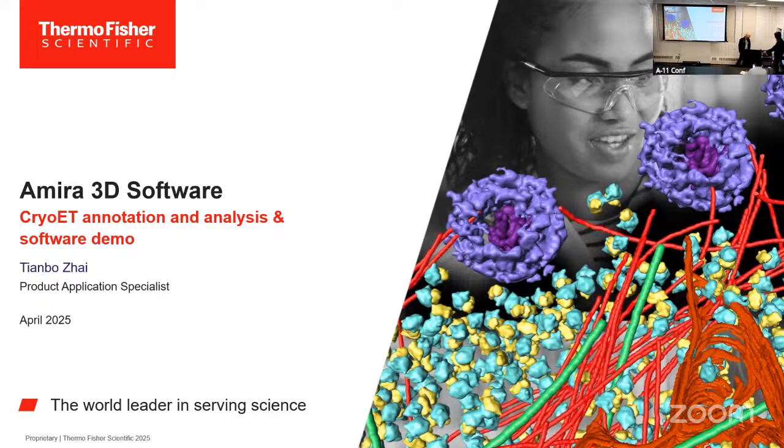What is your favorite part of the CryoET workflow? Tianbo, you go first. For me, that probably will be the annotation part of it, because nowadays there are an array of different tools available for me to do a pretty accurate annotation. I get to choose between the manual one or some semi-automatic or even automatic annotation. So I find that really makes the work a little bit easier in terms of the analysis. I would say that's probably my favorite part about it.